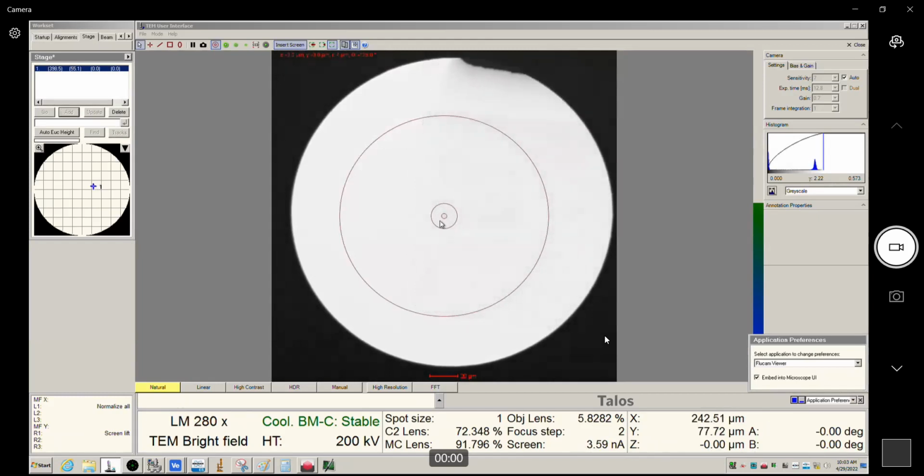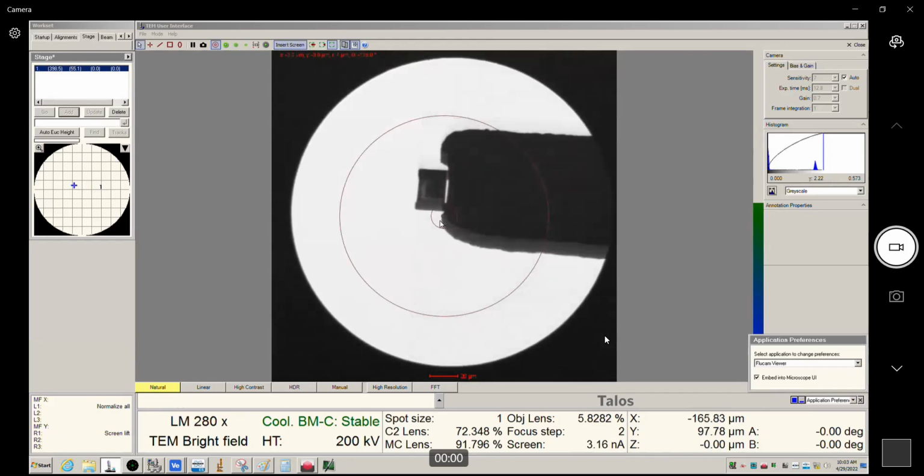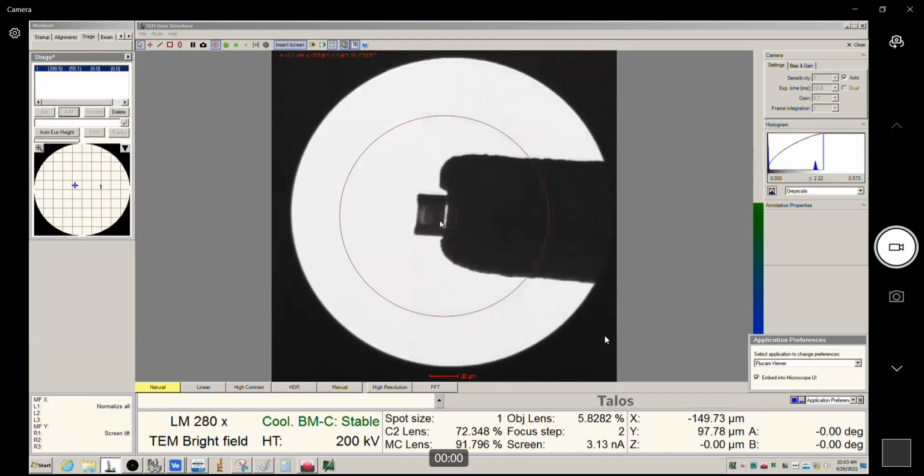So obviously we would probably want to do that, but this is quick. In other words, let's say that's one sample. And then here's another one. Now right here, if you just click add, it just gives it a number. But if you know the name of the sample, I'm just going to call this lamella, and then if you hit return, oh, okay, it actually renames the first one. If we click add, it adds this position. And if we want to rename it, we call it lamella 2, and it will rename it.